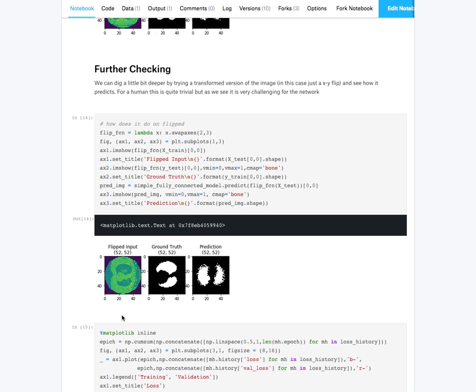This is a very clear case where, if you were to do a threshold and say, okay, everything inside the body that's very low absorption is probably air and probably belongs to lungs, you'd have a very robust method. If you rotated your image, if you scaled your image, you'd still get very good results.